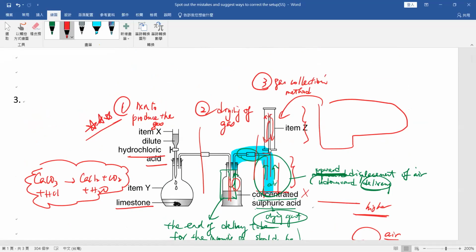Depending on what you need, you need to consider different methods. The first of all is the density of the gas. The second is the nature of the gas. While you have the interaction with water, you may use different methods. Of course, if the gas is said to be dry, you need not consider this. You simply think of the density of the gas.